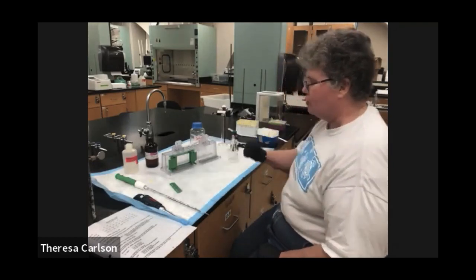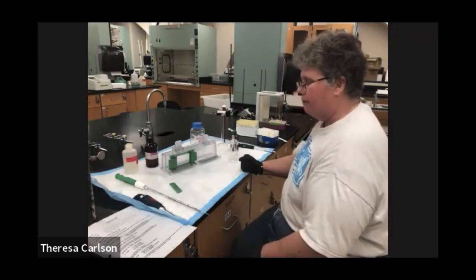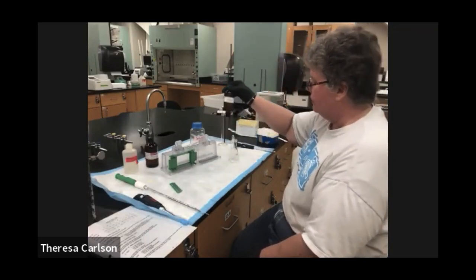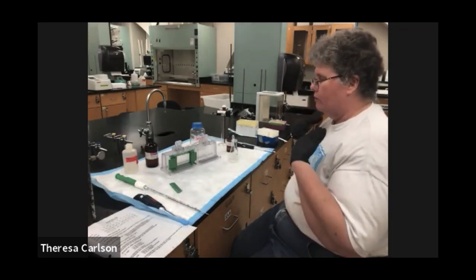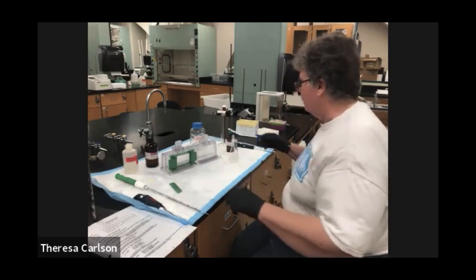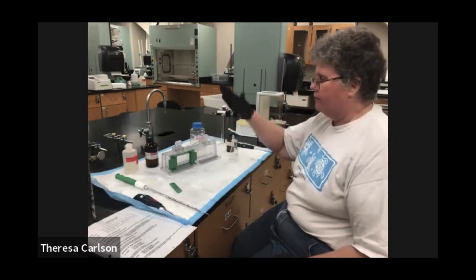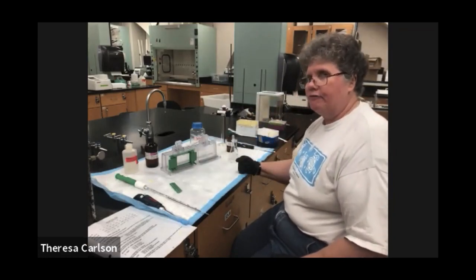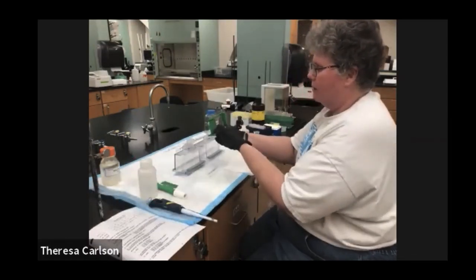So now it's just a waiting game. We're going to come back in about 15 minutes and we're going to see if it is polymerized. You also need to make sure that you have your T-amyl alcohol ready to go, because all the time I have students who forget their T-amyl alcohol, and they're going around, they're looking for a pipette, who's got the T-amyl alcohol, and it's all polymerized and basically not very linear on top of their gel by the time they find everything they need. So now we have our polymerized gel.